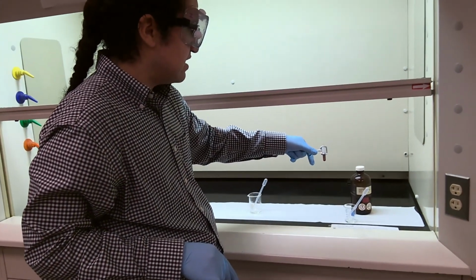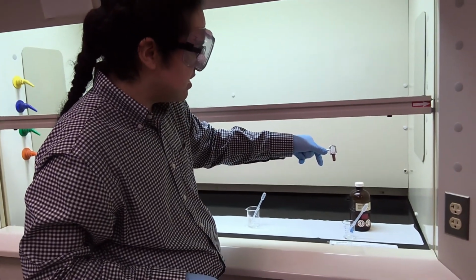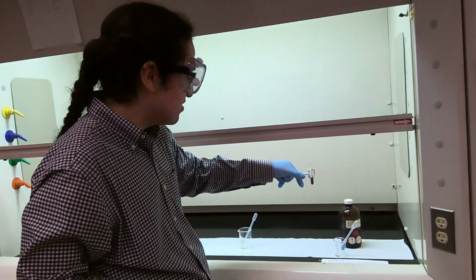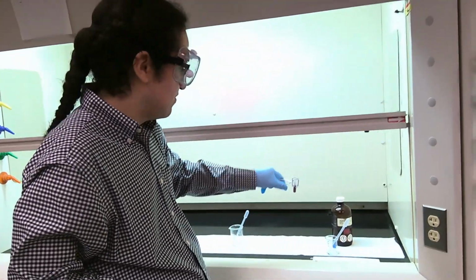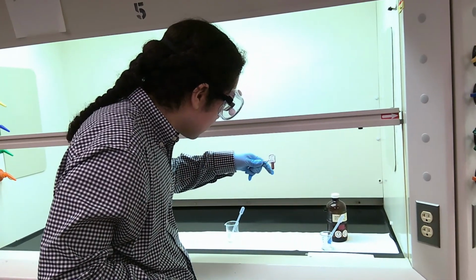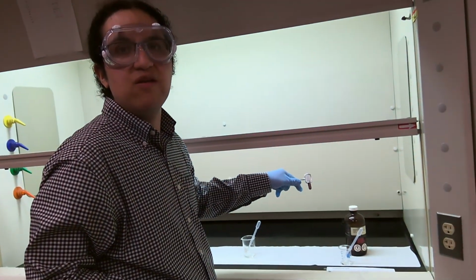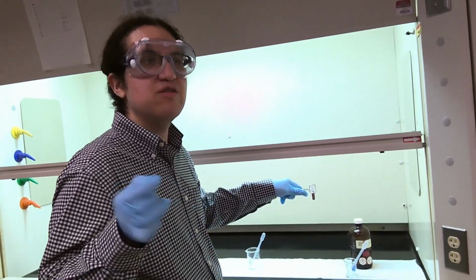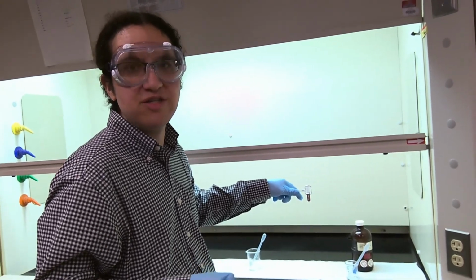The excess magnesium, we add sulfuric acid dropwise. As you notice, the magnesium is reacting with the acid to generate a gas, and our solution is the brick red color of copper. We'll continue this process, and then we will centrifuge this sample, and we'll return once we have centrifuged our samples, and then we'll talk about the drying procedure.